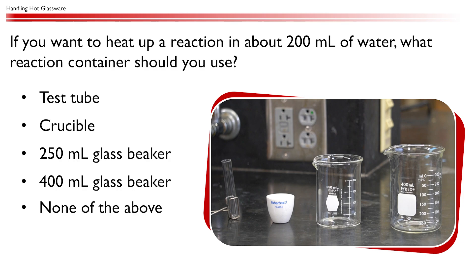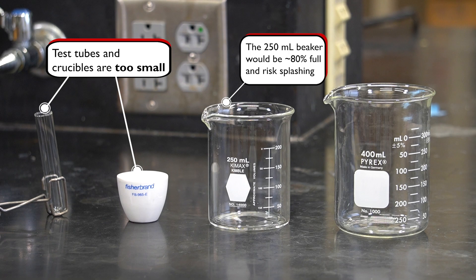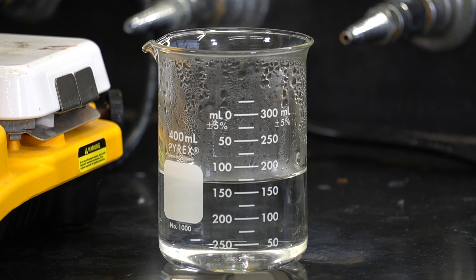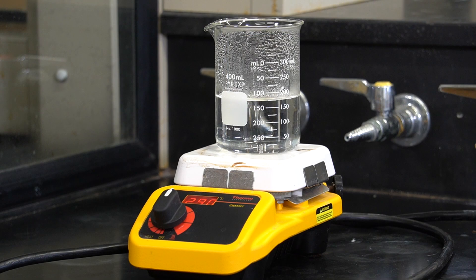If you want to heat up a reaction in about 200 milliliters of water, what reaction container should you use? The best option is the 400 milliliter beaker. Test tubes and crucibles are too small, and crucibles are typically used for heating solid samples. While a 250 milliliter beaker can technically hold the reaction, it would be 80% full, posing a risk of splashing when the water boils. A good rule of thumb is to never fill the container more than two-thirds full — therefore the 400 milliliter beaker is the safest choice.